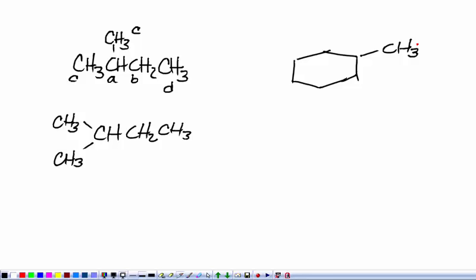So we got a 2, 3, and a 4. 5? I like 5. Definitely the CH3 is 1, right? Because there's no other CH3s in the molecule. I also like that hydrogen there that you may have to put in. No other CHs in the molecule, is there? Nope. So that's a B.